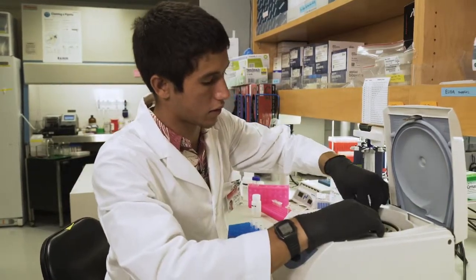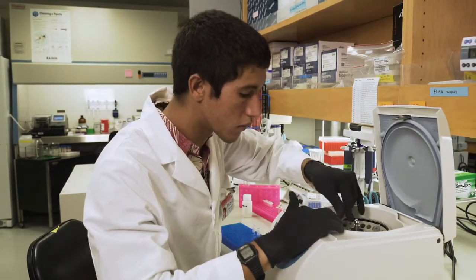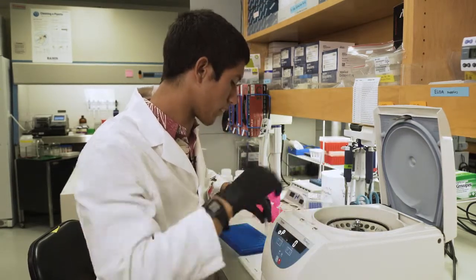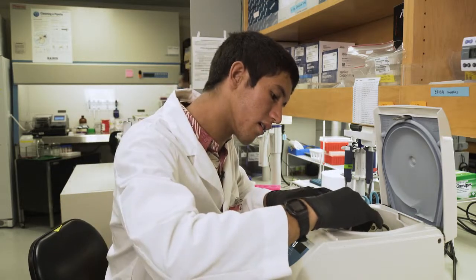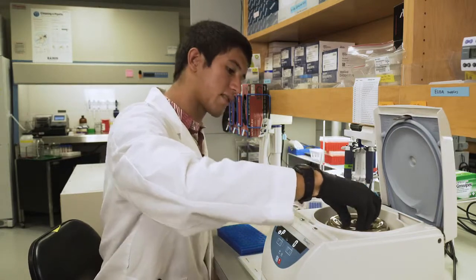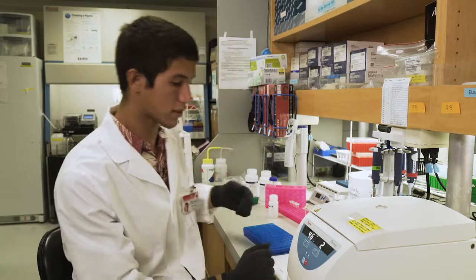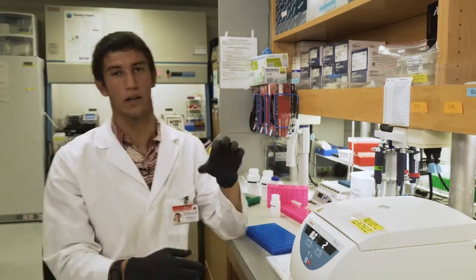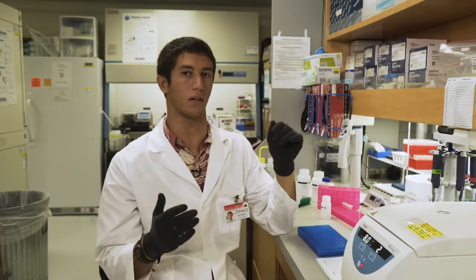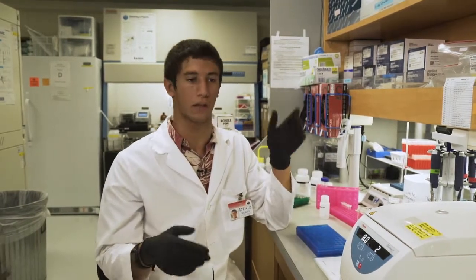All right, so this is the last spin in our centrifuge. We're going to let it spin for 2 minutes at 8,000 RPM. And now this spins for 2 minutes. When this is done, we're going to go ahead and toss the filter columns off the top. There won't be anything in them we want anymore, and you can't reuse them because they're contaminated with just DNA.